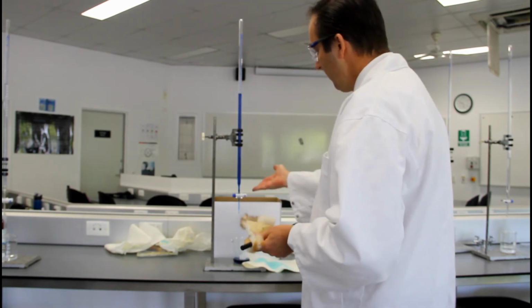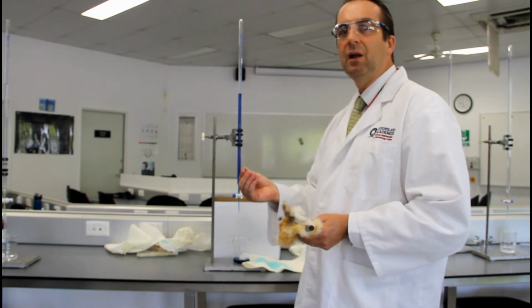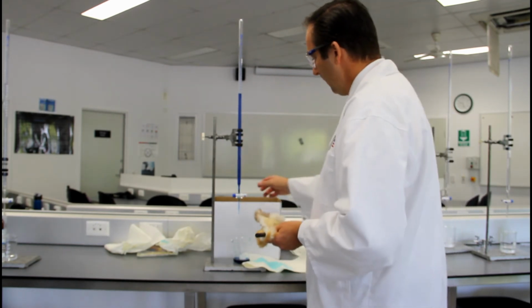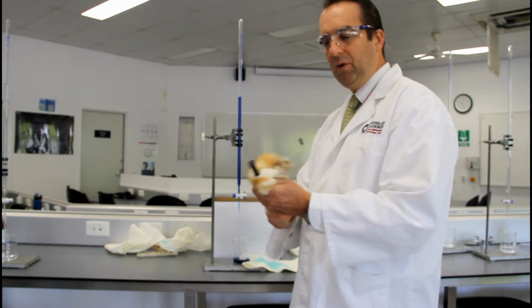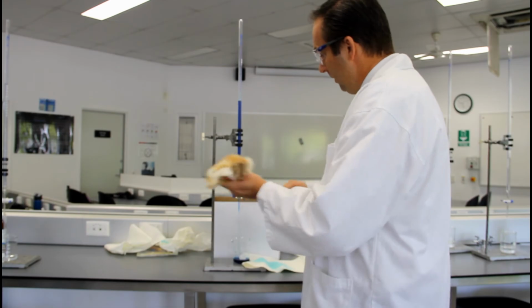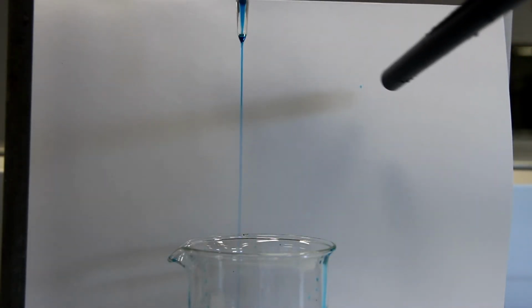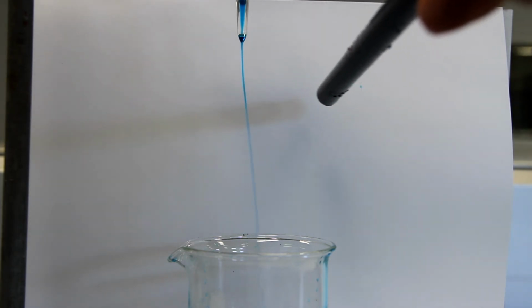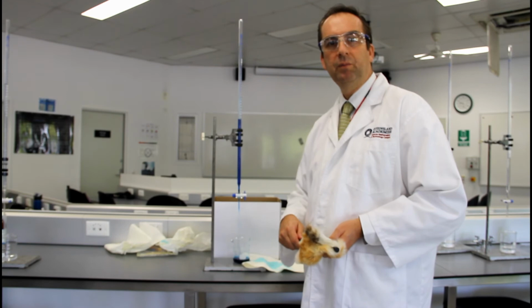So let's have a look at that. Now I've coloured this water blue with just some food colouring so that it's easier to see. So I'll get the stream running here, like that. And if I charge up the rod again, you can see with the blue food colour in the white background, you can see it is quite strongly attracted to the charged rod because it is so polar.